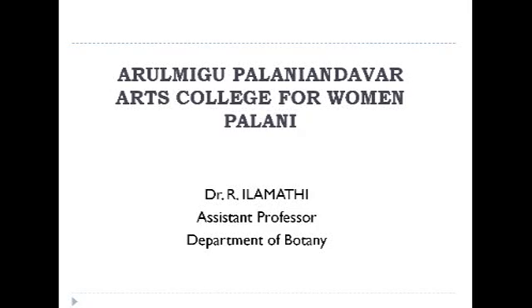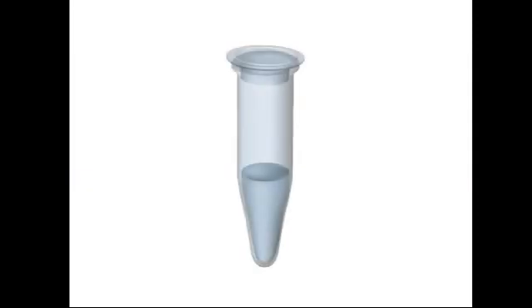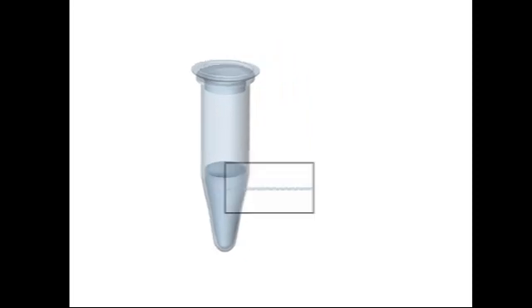The topic that I'm going to discuss in this video is about PCR. PCR stands for polymerase chain reaction. PCR is a technique used in molecular biology to amplify a single copy or a few copies of a segment of DNA across several orders of magnitude, generating thousands to millions of copies of a particular DNA sequence.